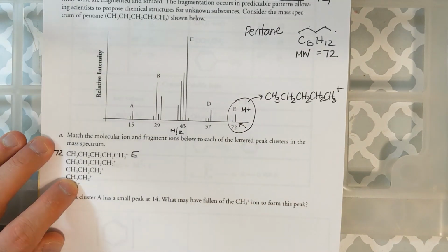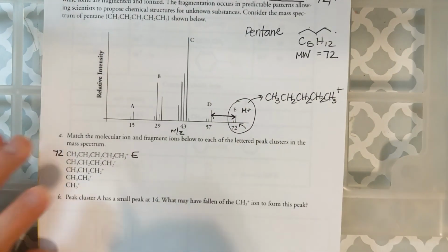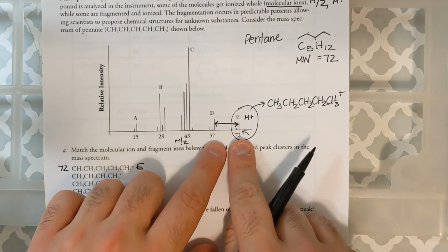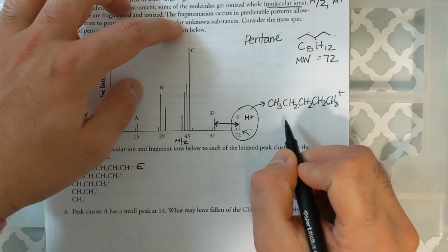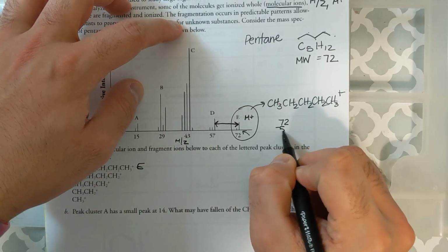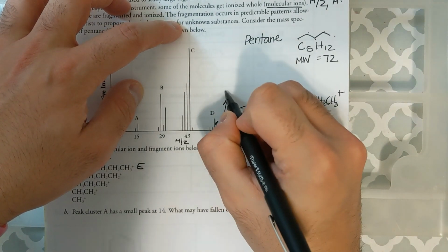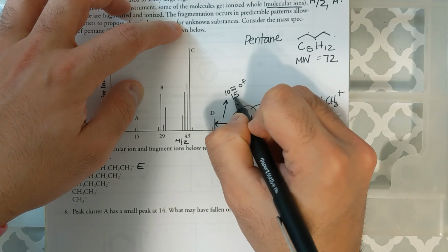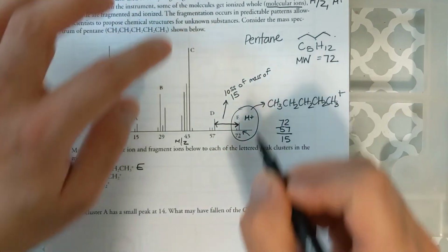Then I have peak D. I notice the difference in the mass between peak E and D, and this is what you have to do when you start doing mass spectroscopy. Going from 72 to 57, if I subtract that, that's 15. This is a loss of 15.